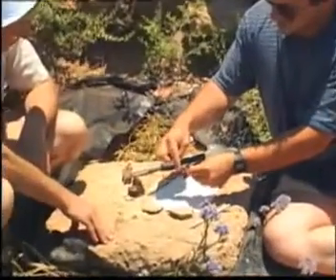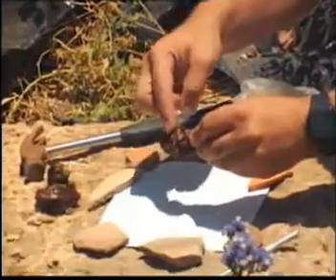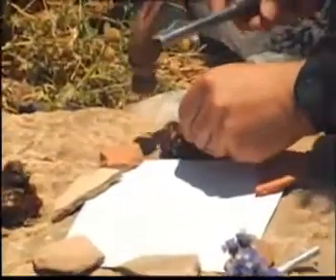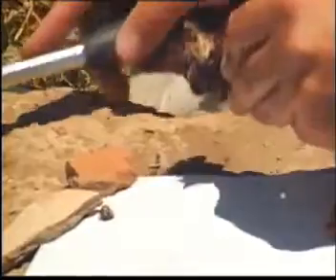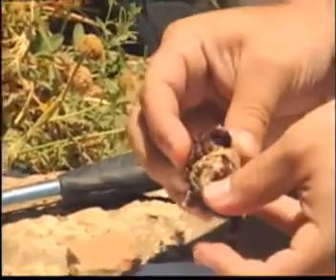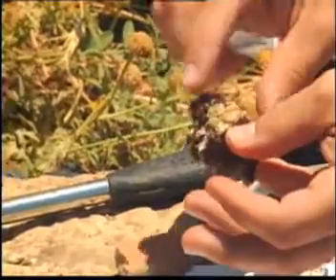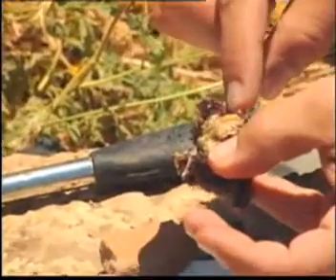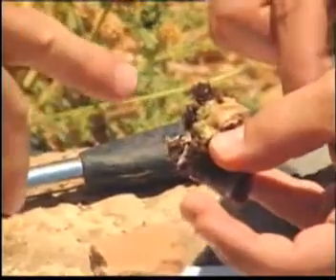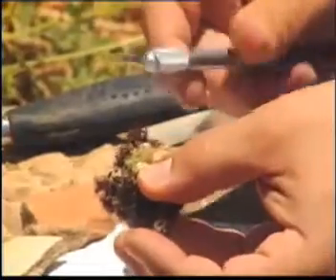On the back of the snail there's what they call the hypobranchial gland — that's where the dye is stored, and that's what we're going to get to. We're going to try to break that open now. You break it right at that point. There it is — that whole yellowish gland — that's what we need, that's where the dye is stored.